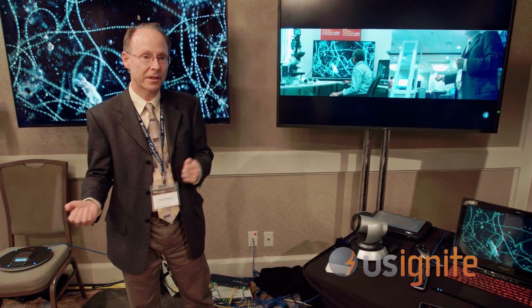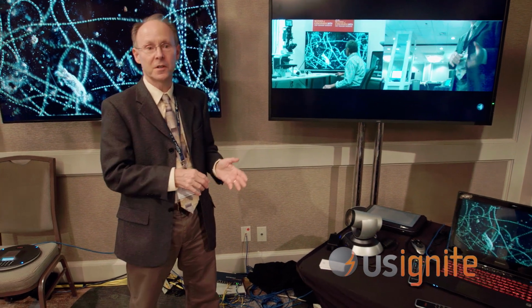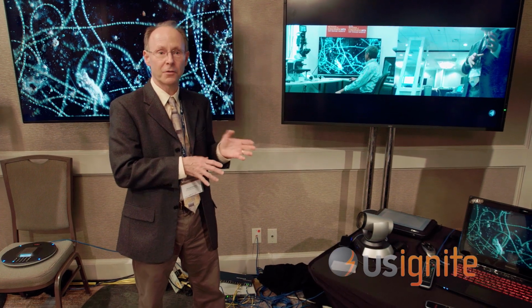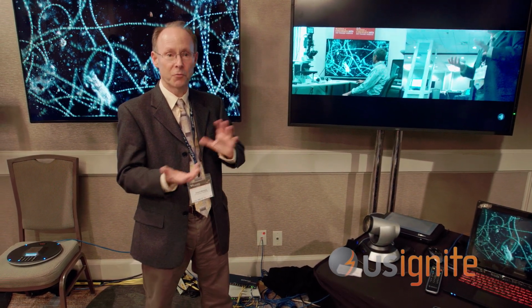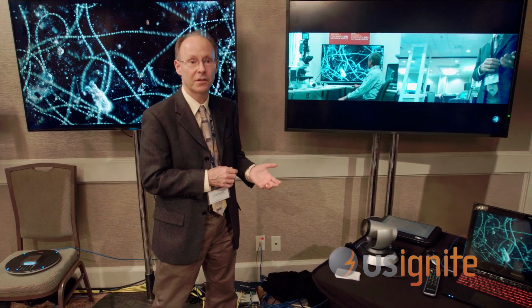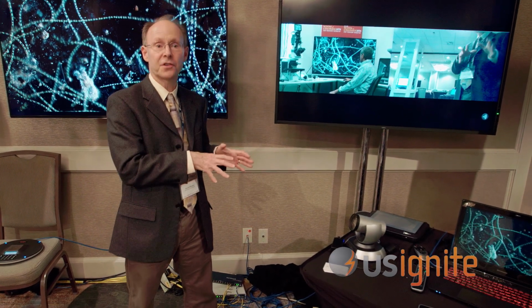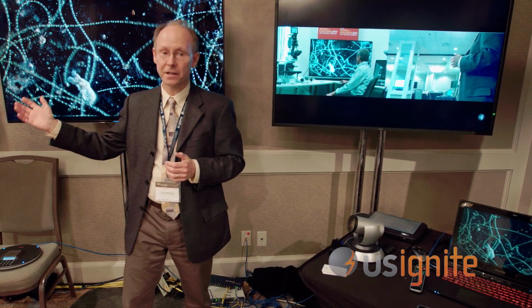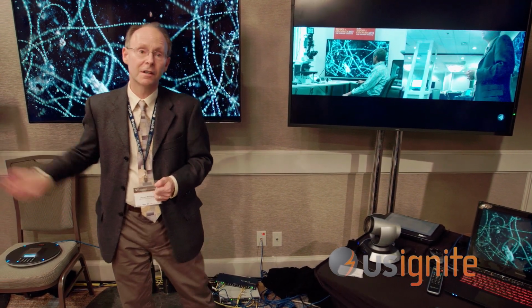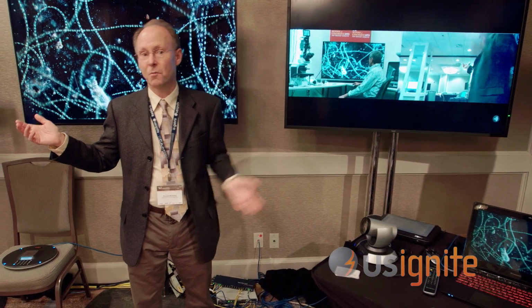So we're starting with a system at USC where we've incorporated a digital cinema camera, usually developed to shoot Hollywood movies, with a really high quality microscope so that marine microbiologists at USC can place the type of samples that they're working with, which are plankton from the Pacific Ocean, and then stream them live in high definition to a STEM high school, starting with one in Chattanooga, Tennessee. This allows students to see what's happening under the microscope 1,800 miles away.